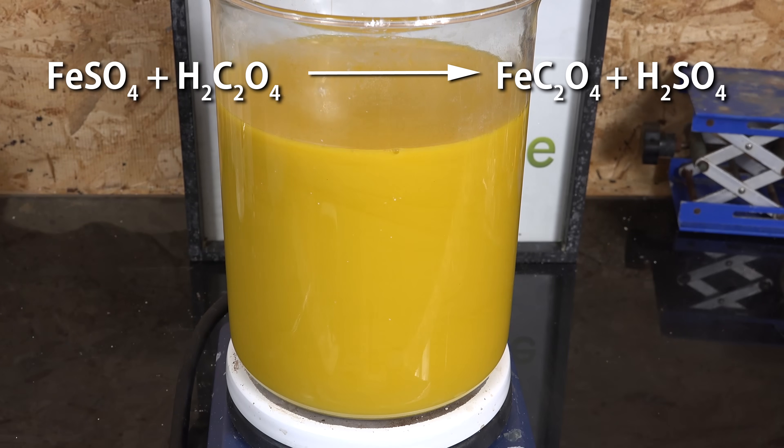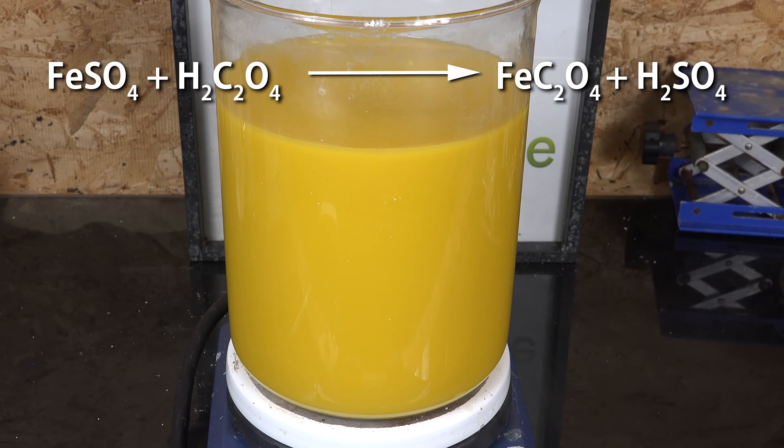Oxalic acid is a much weaker acid than sulfuric acid, and usually if you react a weak acid salt with a strong acid, you make the weak acid and the strong acid salt. And if you react a strong acid salt with a weak acid, like we are here, usually nothing happens.